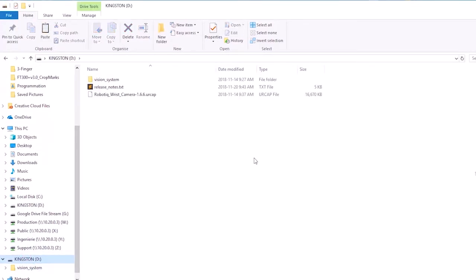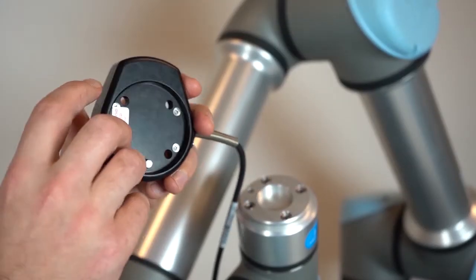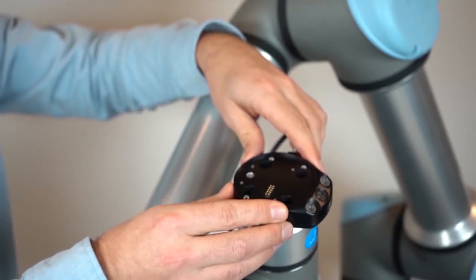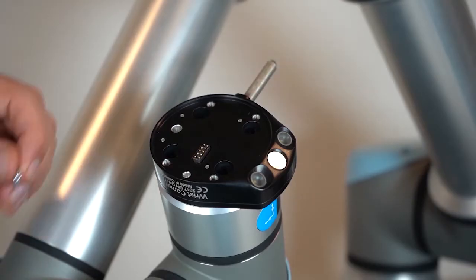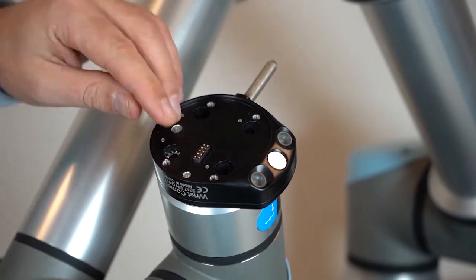We will now mount the camera on the robot. With the robot turned off, align the camera's dowel pin with the hole on the robot wrist. Screw in using the provided screws.